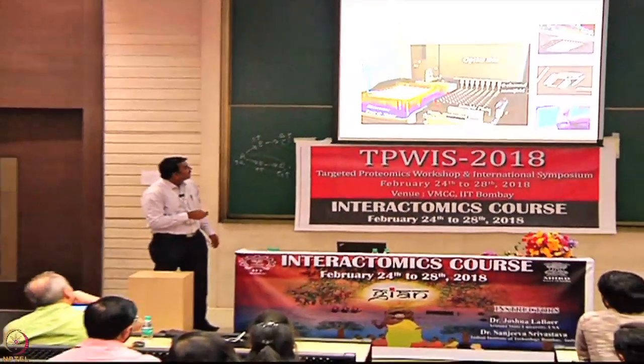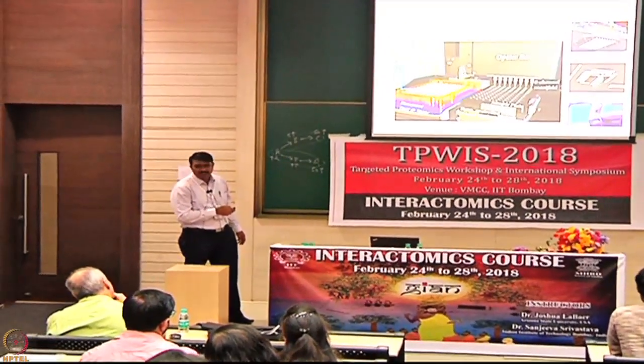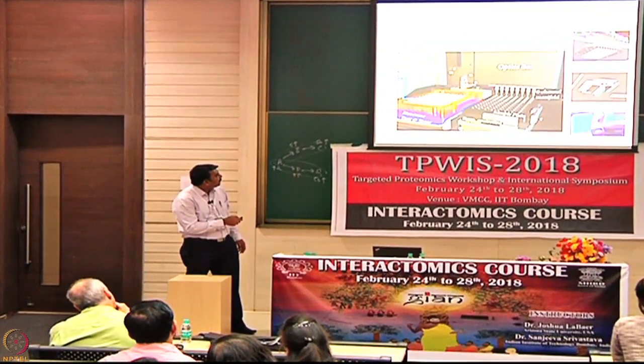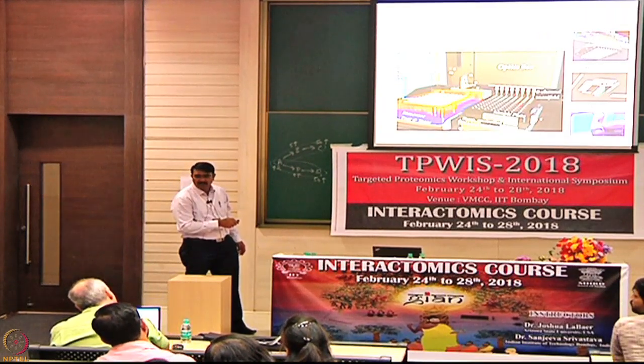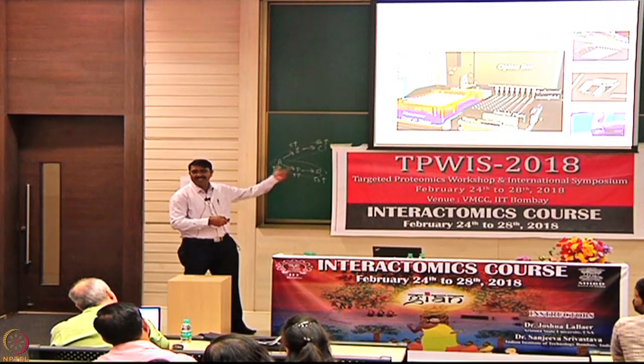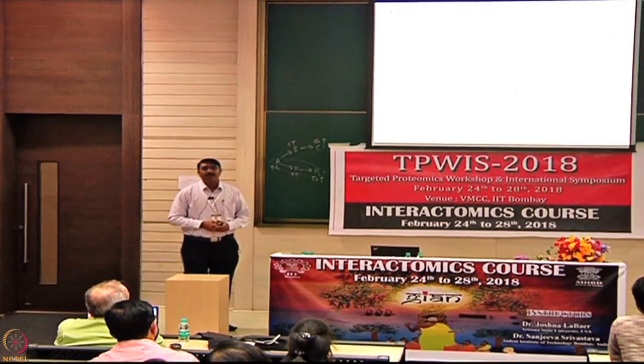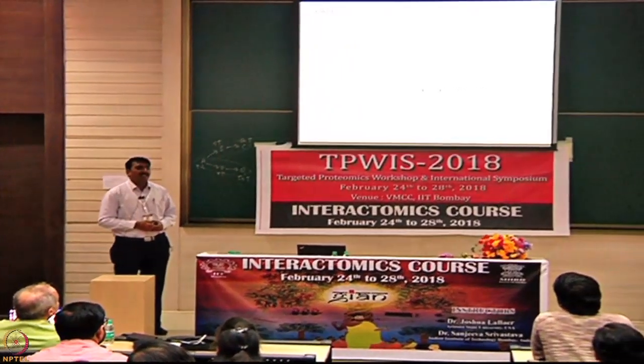Okay, so this is the sensor compartment. The robotic arm picks up the sensor and dips it into the well containing the first buffer. I'll show you that in the subsequent slides. So what exactly is the principle behind this? As I mentioned, it's interference based.